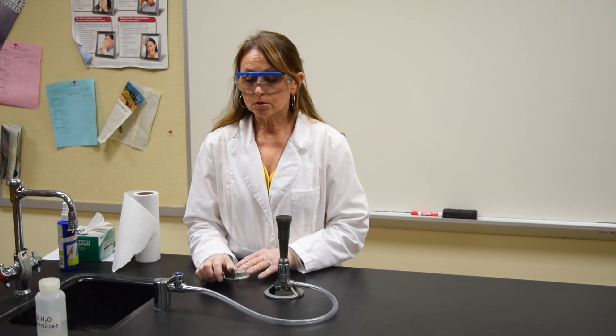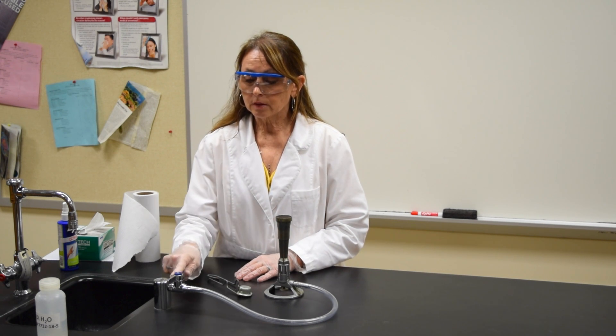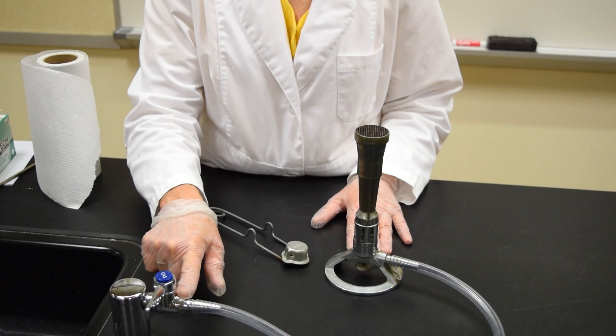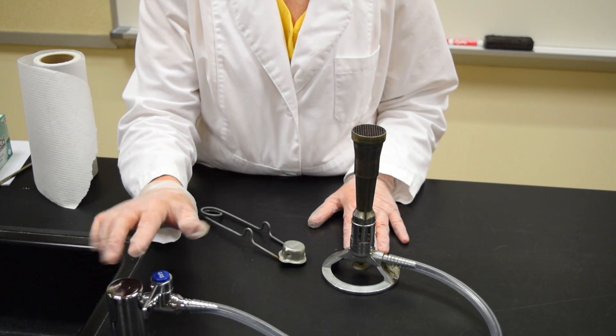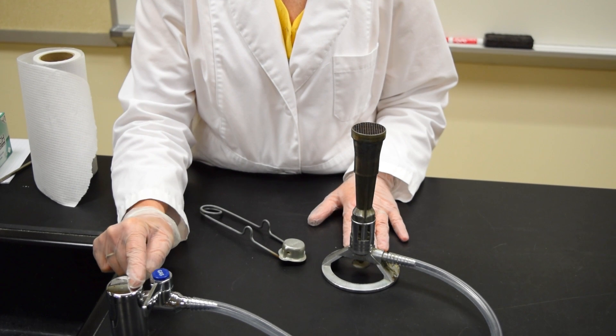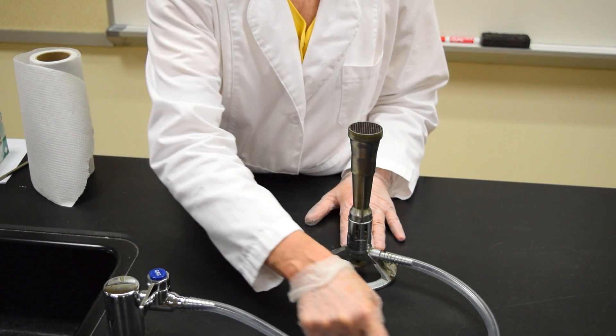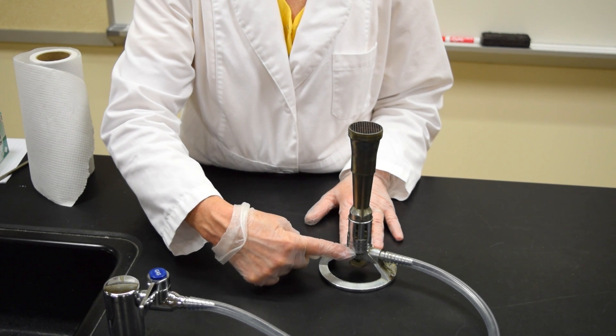To turn on the Bunsen burner, the gas nozzle at this point should be perpendicular. The handle should be perpendicular to the nozzle. That's the off position. Connecting the gas nozzle to the Bunsen burner is a piece of Teflon tubing.